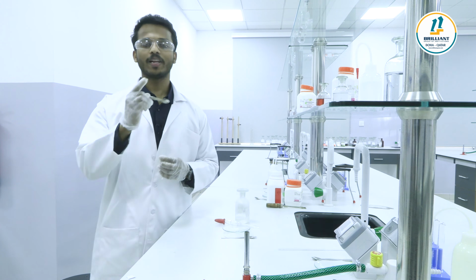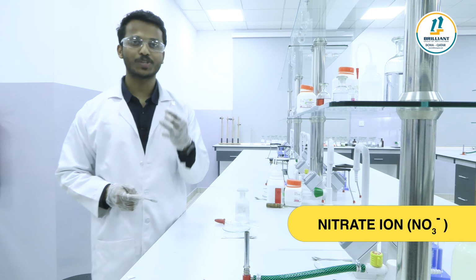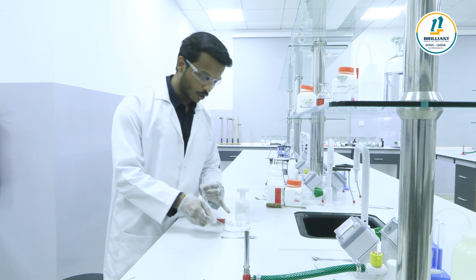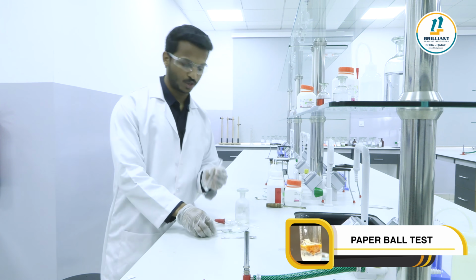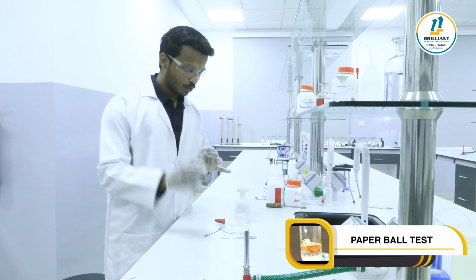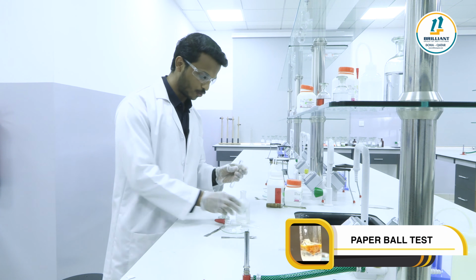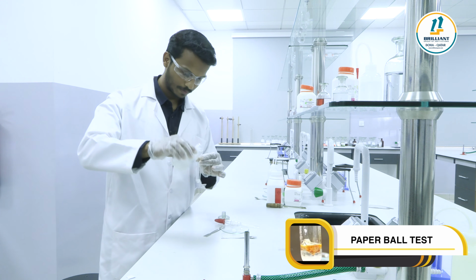Let's do the preliminary test for nitrate ion. That is the reddish brown gas generation test. So take a pinch of salt into the test tube, to which let me add concentrated H2SO4. A few drops of concentrated H2SO4 are being added.